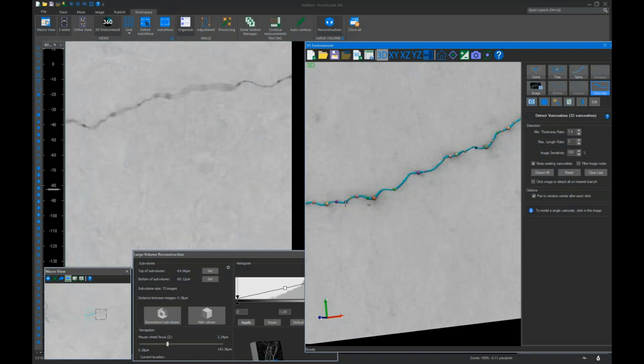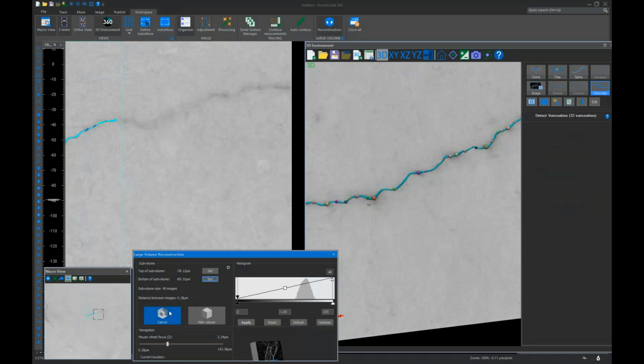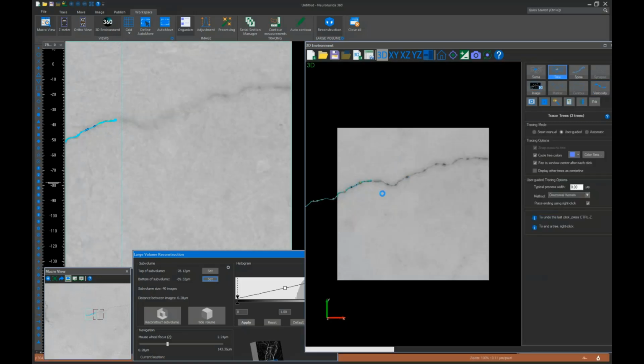And so if we're going to continue this now, again, if you specify an area just above the structure you're interested in reconstructing, and then I hit the button to send it over to the 3D volume, that's a method that will make it very straightforward for you to keep track of something this fine in such a large volume.